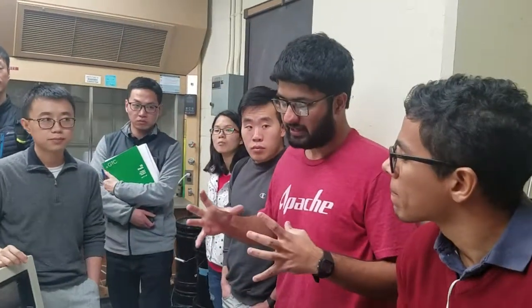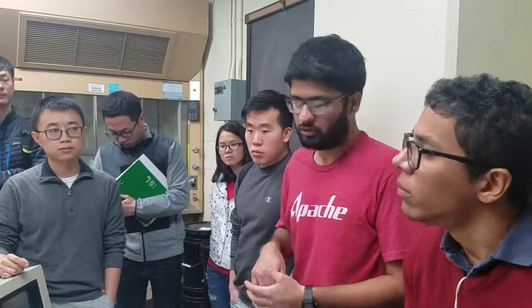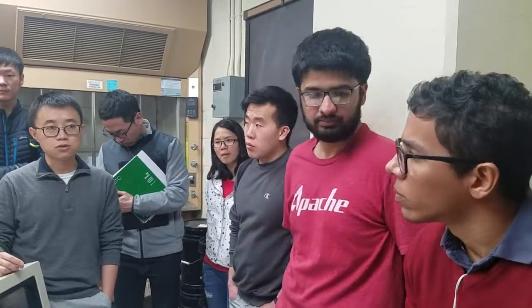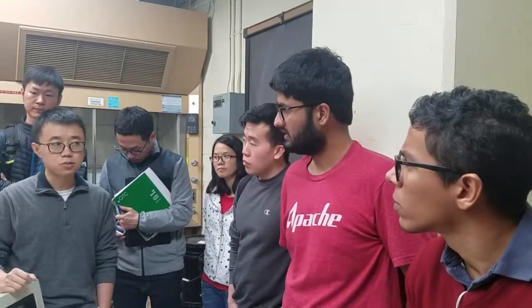Plus, if we have a very big diameter core, we don't see good resolution inside the image, in the middle of the core. So we try to have the core as thin as possible, something that we can work with. You want your X-ray to be attenuated by your sample as little as possible, so you want the size to be small.